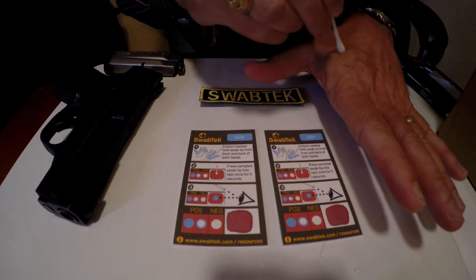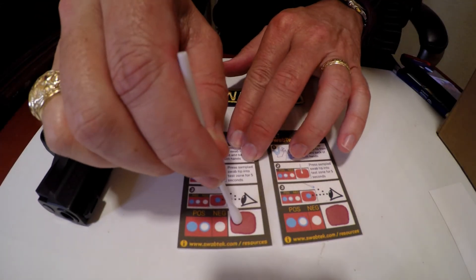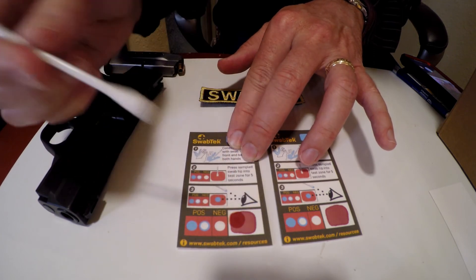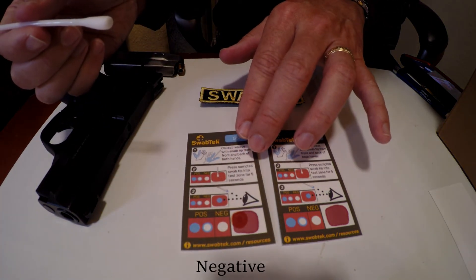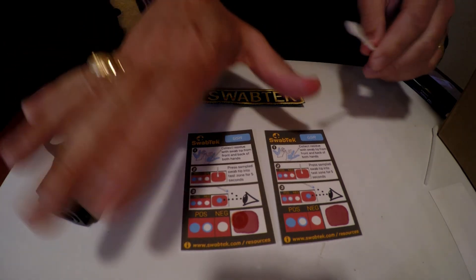Let us show you a negative test first. Collect with the tip of the swab for 5 to 10 seconds. Press it to the reagent zone and hold it there, letting the liquid soak in. This is a negative test — there is no blue color change.